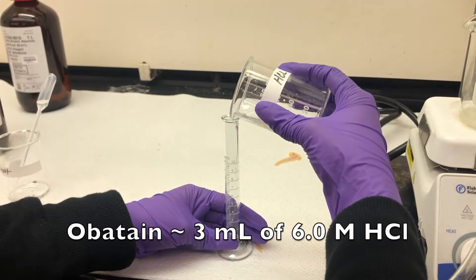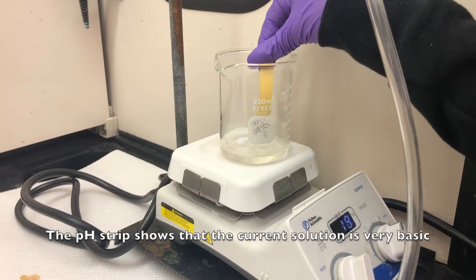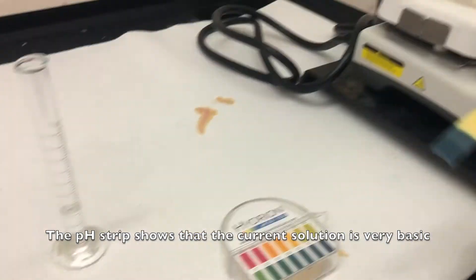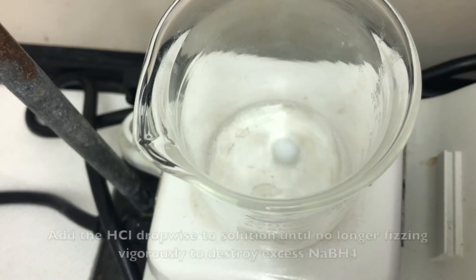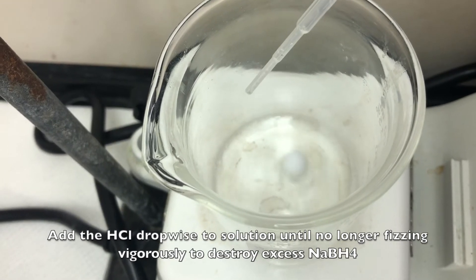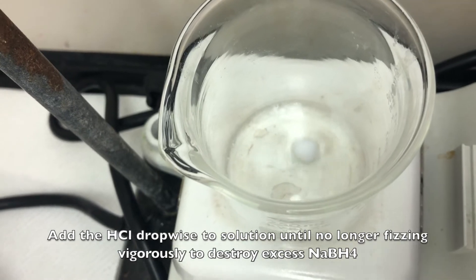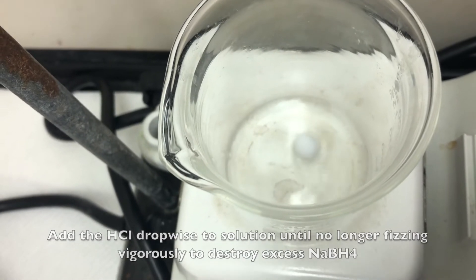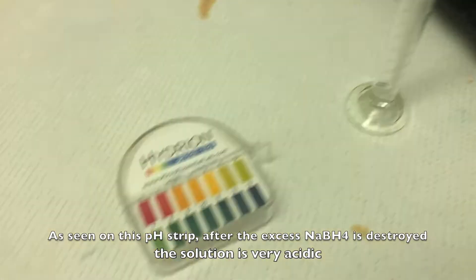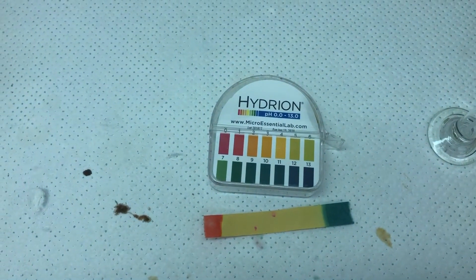Obtain approximately 3 milliliters of 6 molar hydrochloric acid. The pH strip shows that the current solution is very basic. Add the hydrochloric acid dropwise to the solution until it no longer fizzes vigorously, to destroy the excess sodium borohydride. As seen on the pH strip, after the excess sodium borohydride is destroyed, the solution is very acidic.